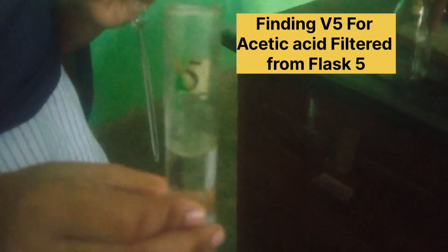By subtracting C1 from initial concentration, we may know how much acetic acid adsorbed on the charcoal in flask 1.